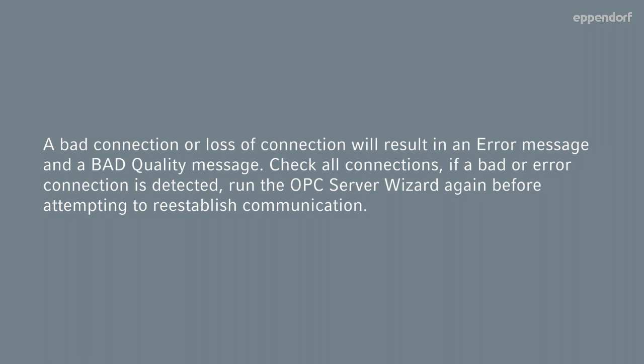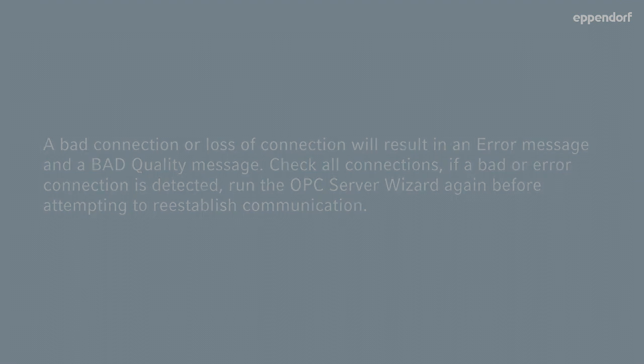Check all connections. If a bad or error connection is detected, run the OPC Server wizard again before attempting to reestablish communication.